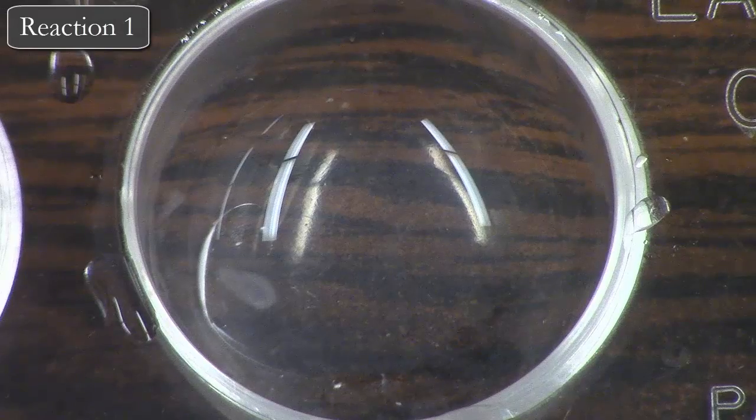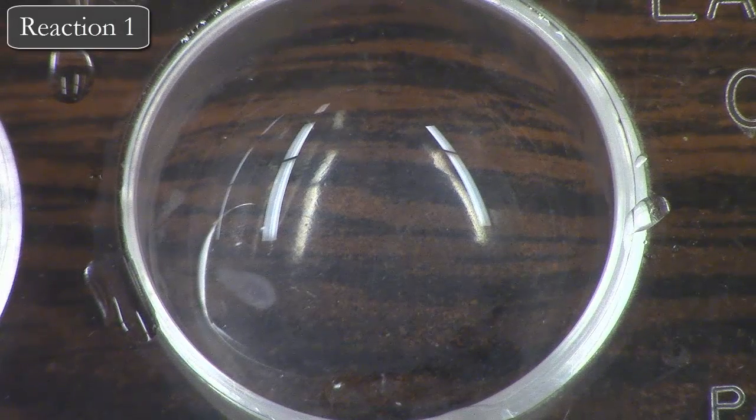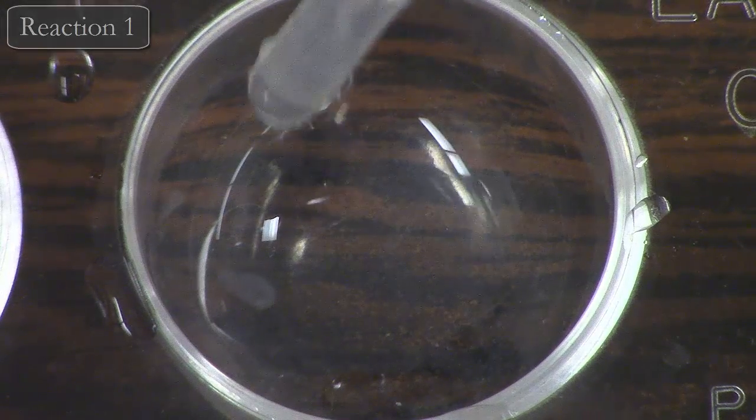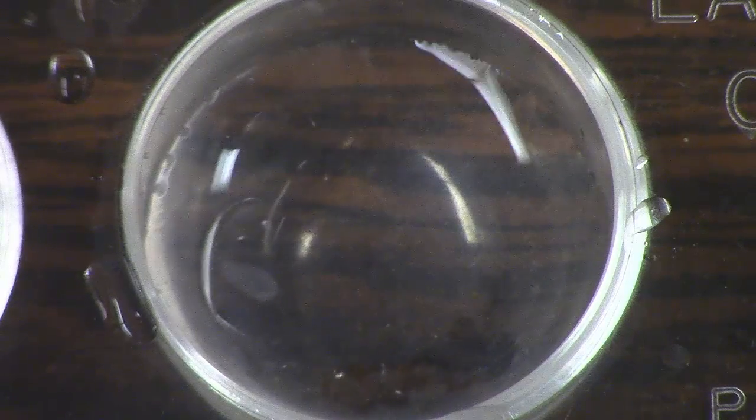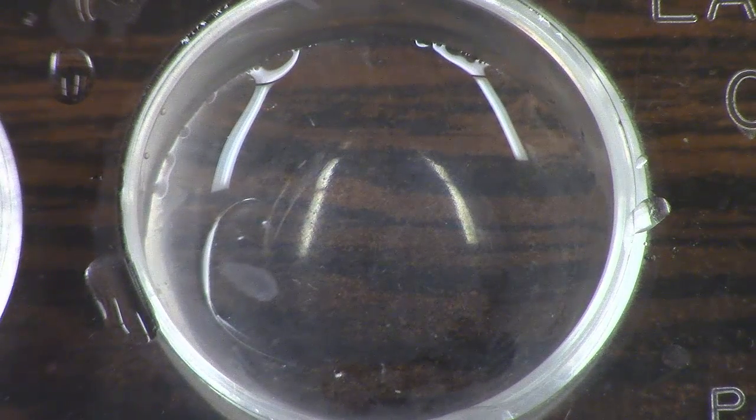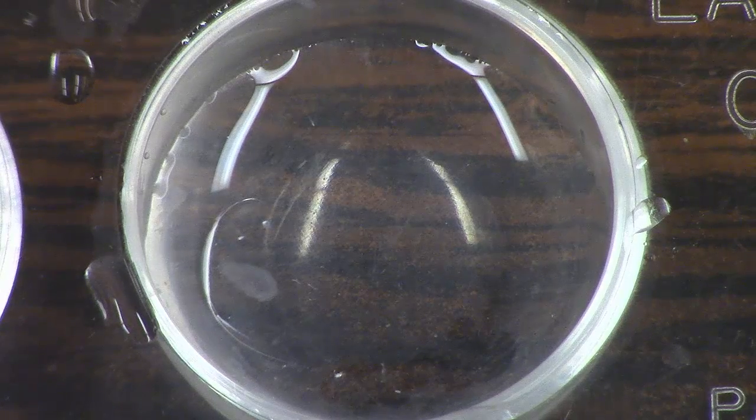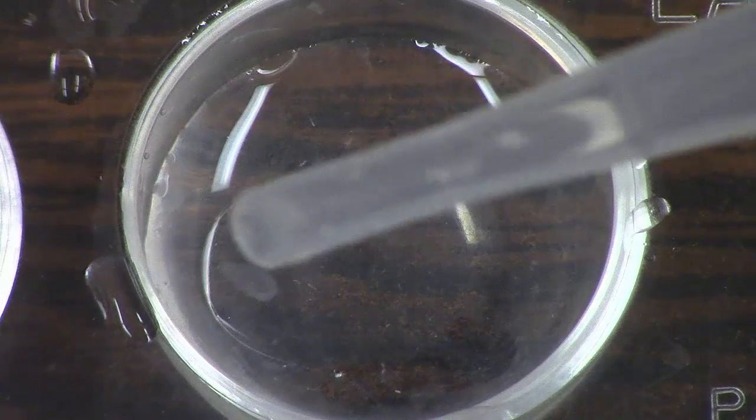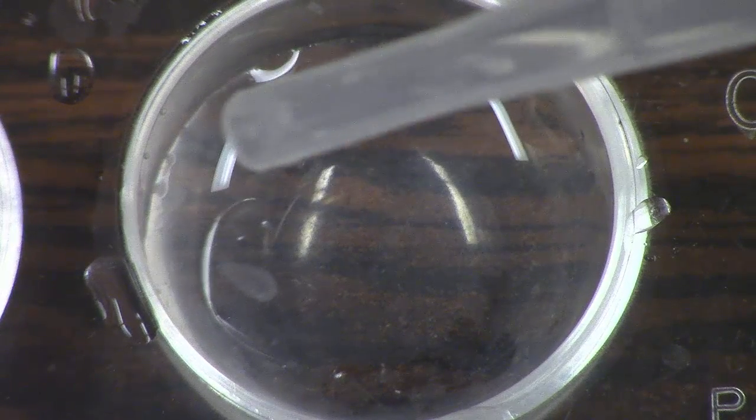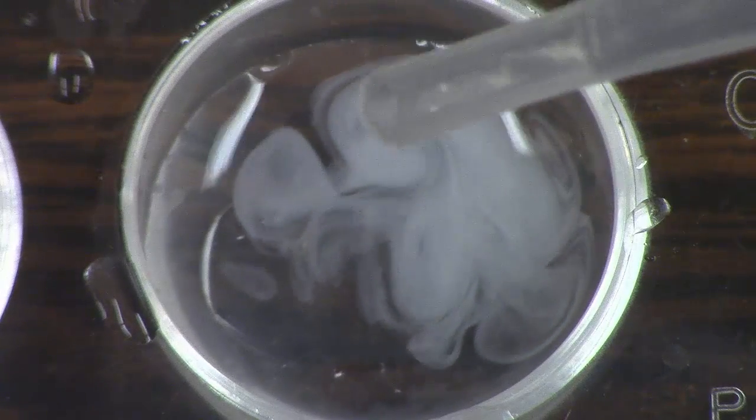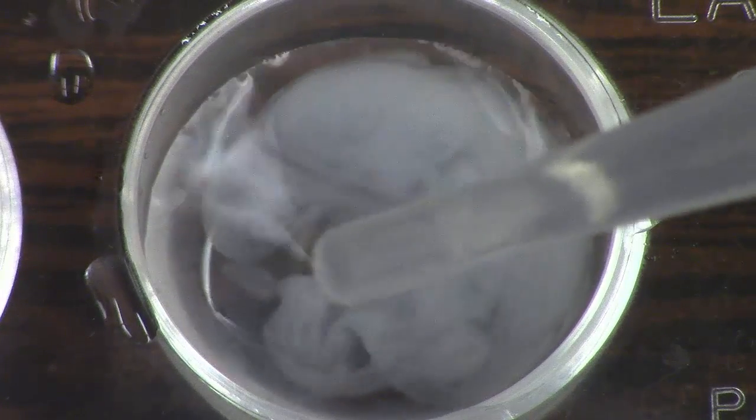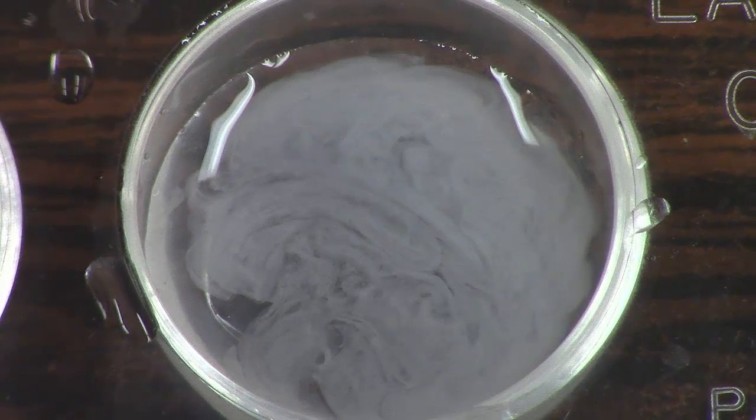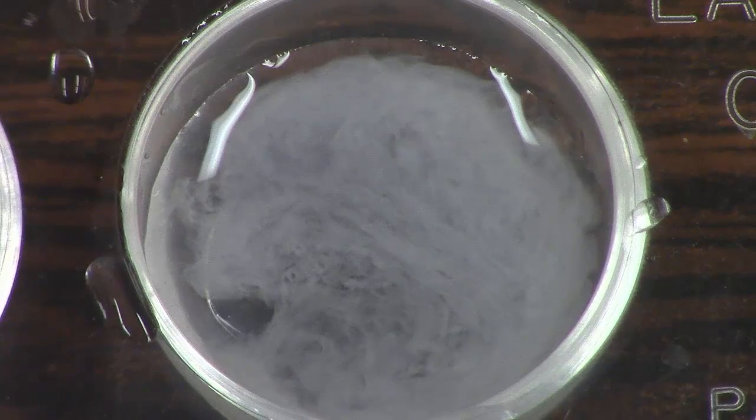For our first reaction, we're going to mix barium chloride with sodium sulfate. Barium chloride is a clear solution, and watch carefully—you can see in the pipette that sodium sulfate is also clear. I'll put a couple drops in there so you can see what happens. Write down some observations and try to predict what products just formed.